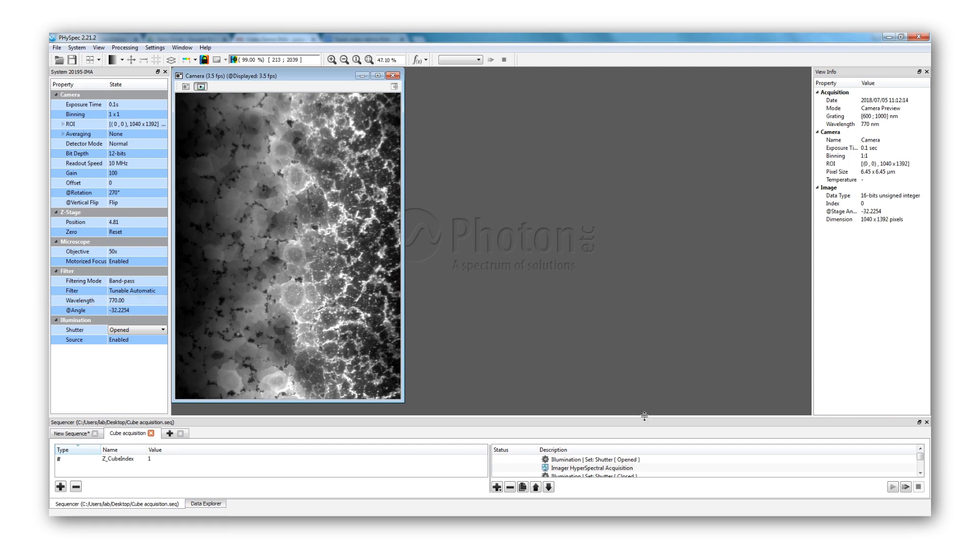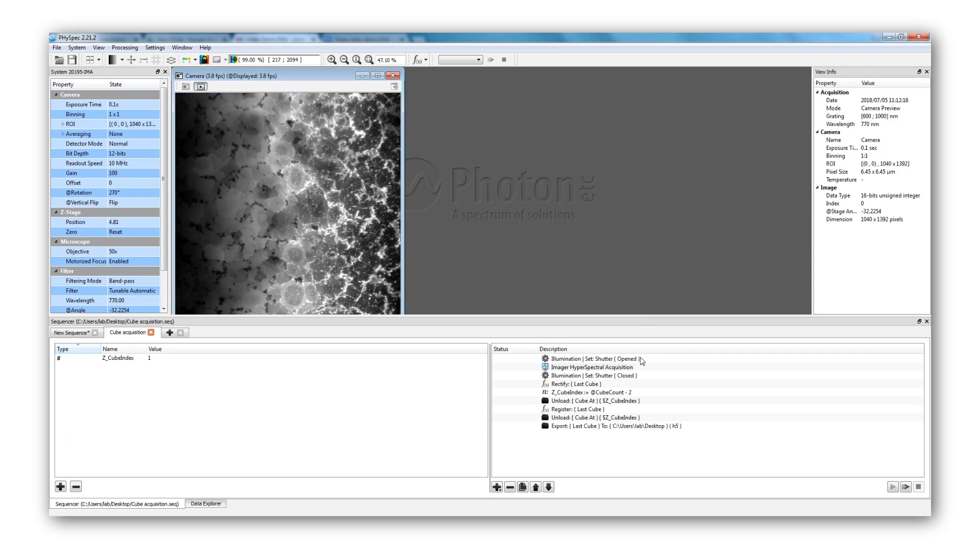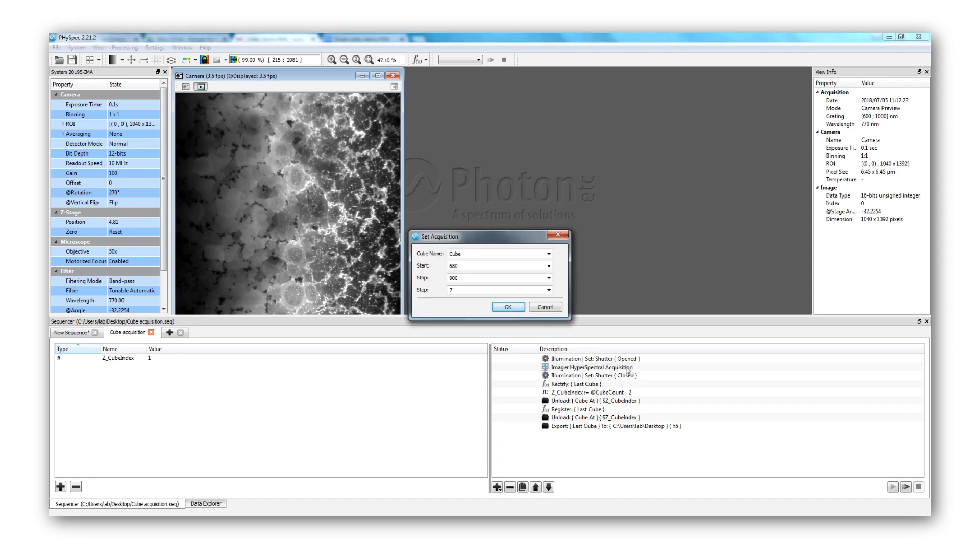FiSpec allows building sequences of acquisition where the laser, the spectral range, and post-processing steps can be implemented. After making sure the laser shutter is open, the next step is the hyperspectral acquisition: we name the data, determine the spectral range, and set the spectral steps between each image. For the demonstration, we will go from 680 nanometers to 900 nanometers with steps of 7 nanometers, meaning every image will be separated by 7 nanometers.